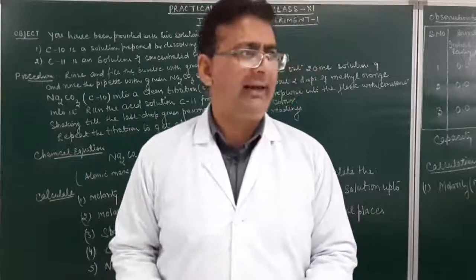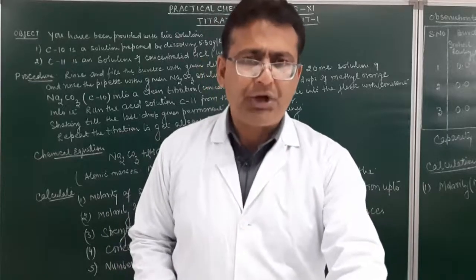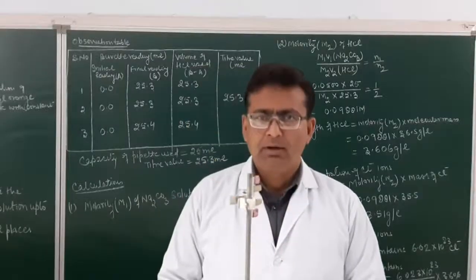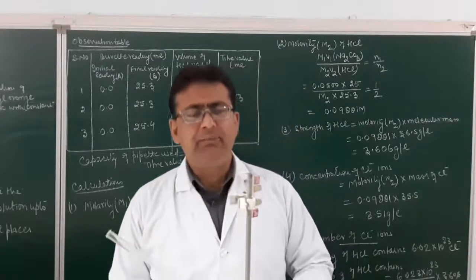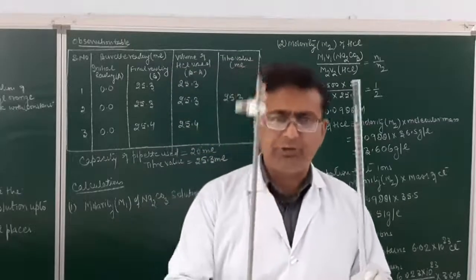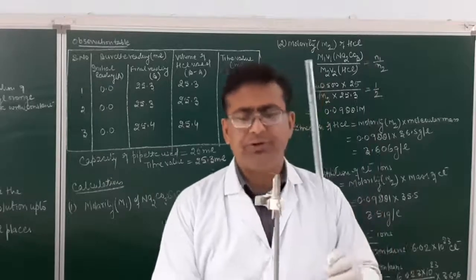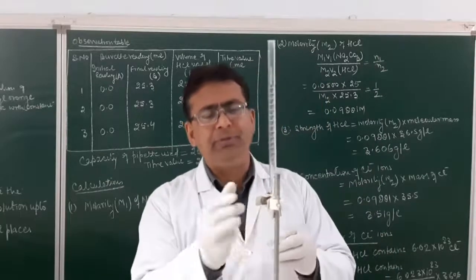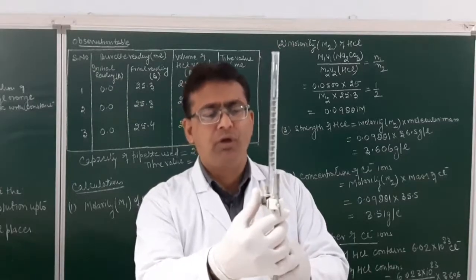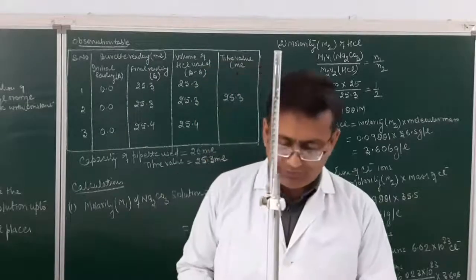So now students, I will demonstrate to you how to carry out the titration practical. This is a clamp stand. This is a burette. I will clamp the burette in the clamp stand. You can see over here the burette is being clamped in the clamp stand.